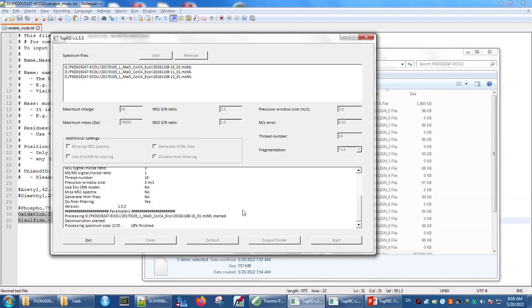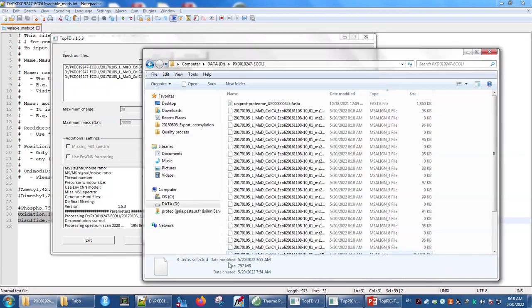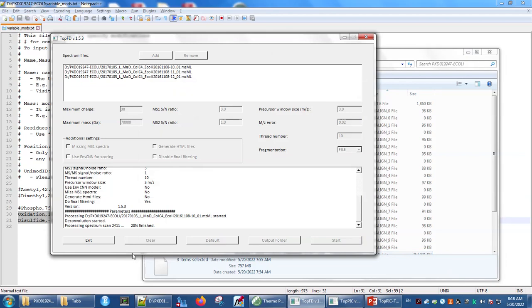Now, I'm going to see if I can make my screen a little taller. Oop, I can't. There. Here we go. No, it's not going to do that. So I'm going to have to hold this guy down and drag him around. Not going to work so well.